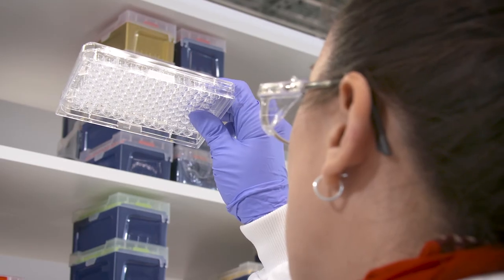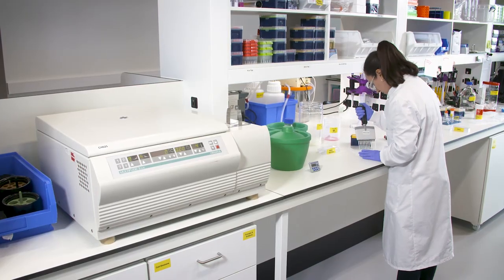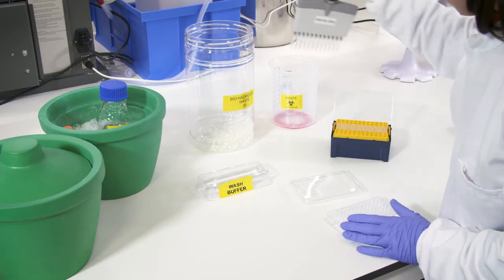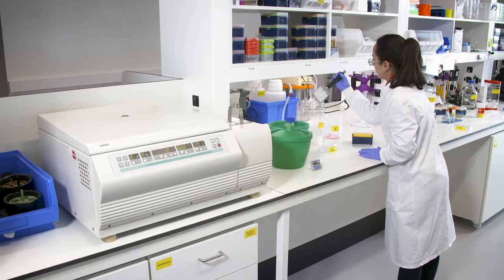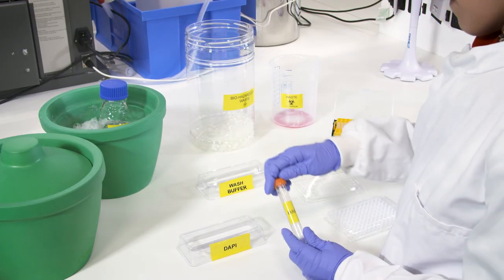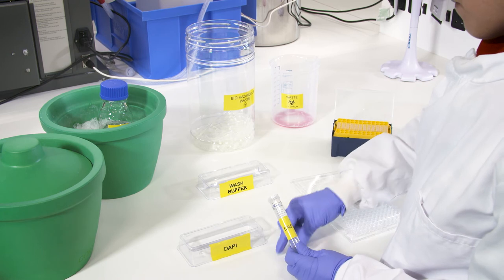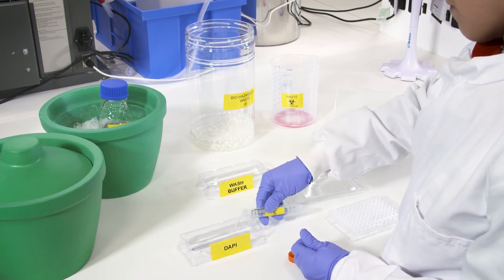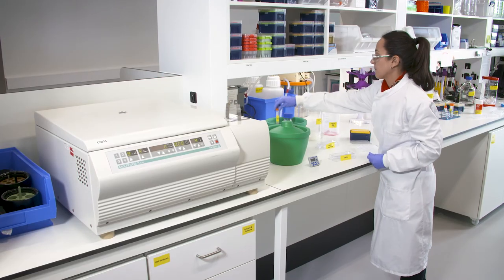As before, ensure the pellet is visible in the plate before discarding the supernatant. Check for live, dead cells by staining with DAPI or other viability dyes for 5 minutes at 4 degrees Celsius in the dark before analysis at the flow cytometer.